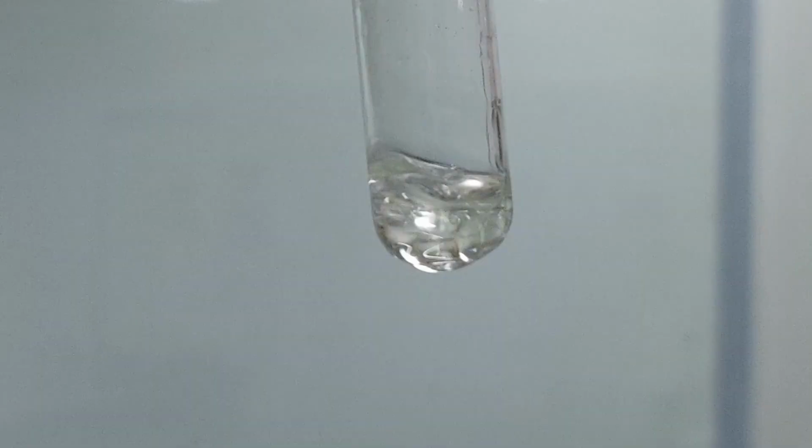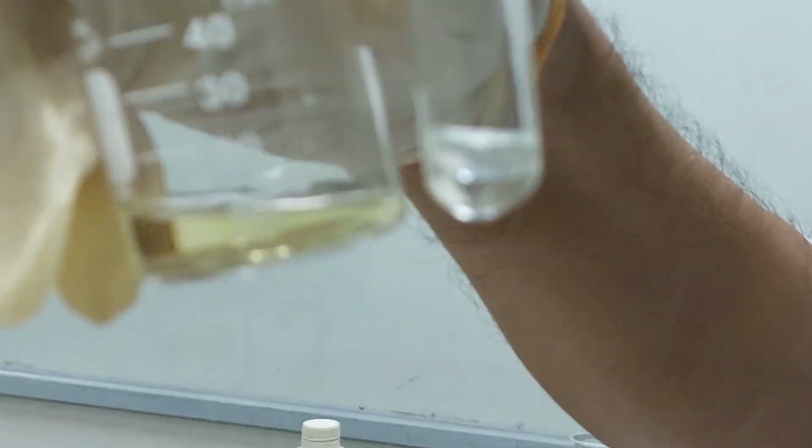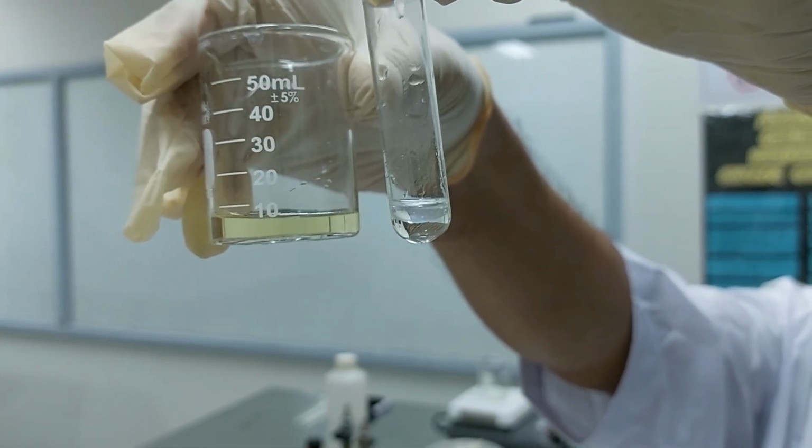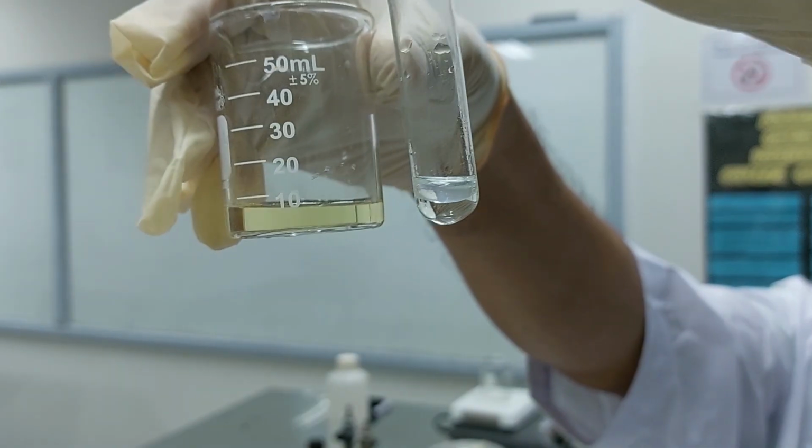Of course, they will not mix. So if you notice, look at the color of the benzene layer. It's still the same. Look at the color. Compared to acetylene, it's really colorless.